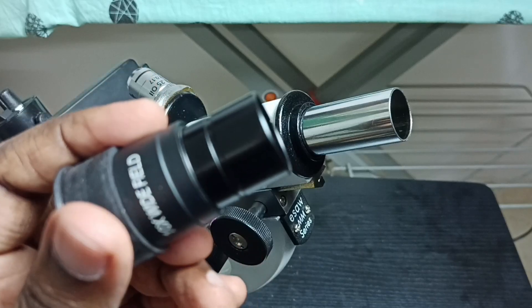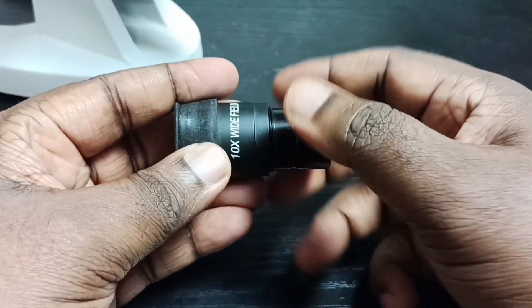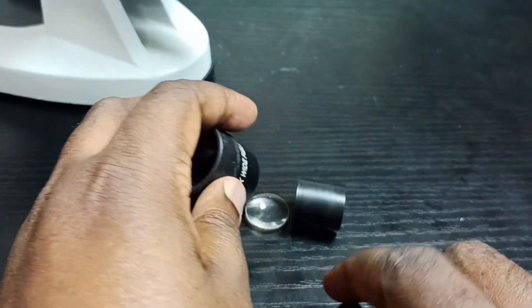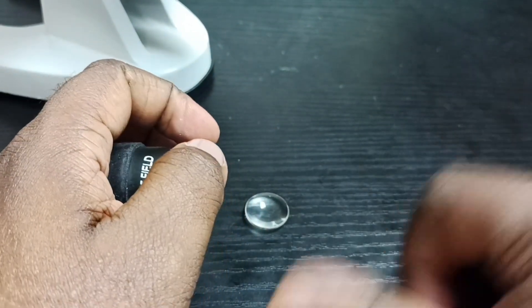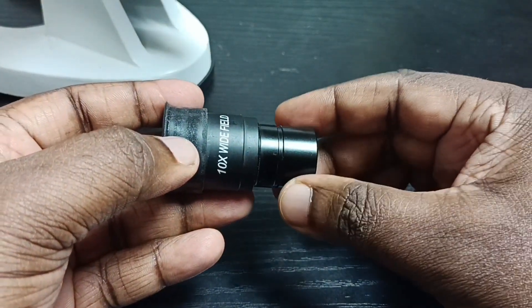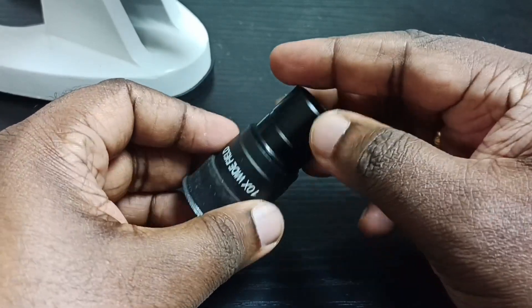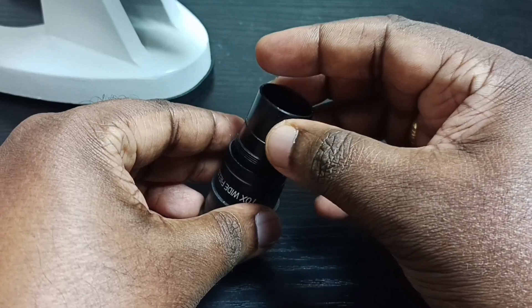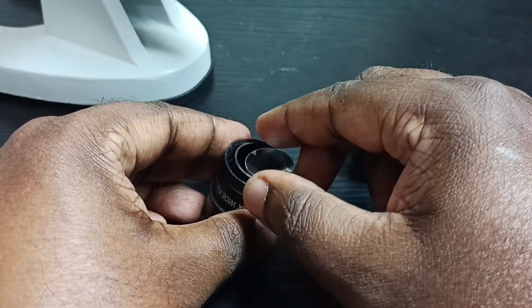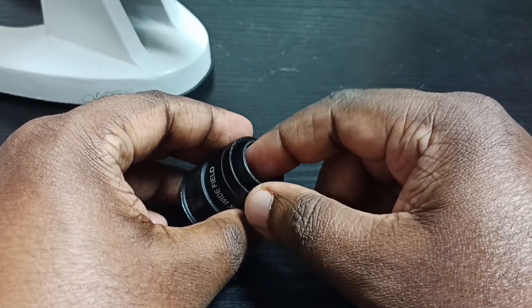Now I'm going to open this and clean it. We can rotate this part to open it. Then we can slowly open it — there is a lens. This is the first lens; take it out.